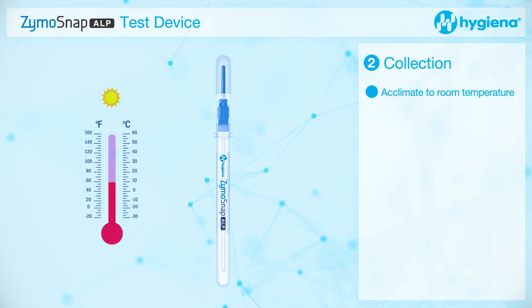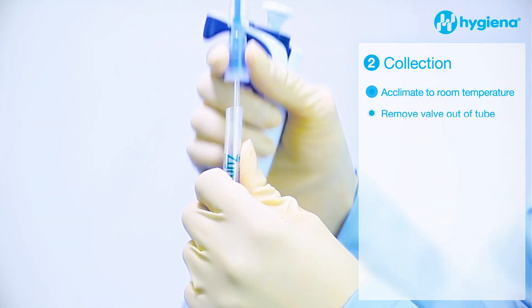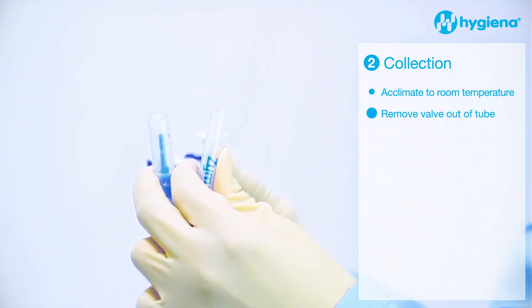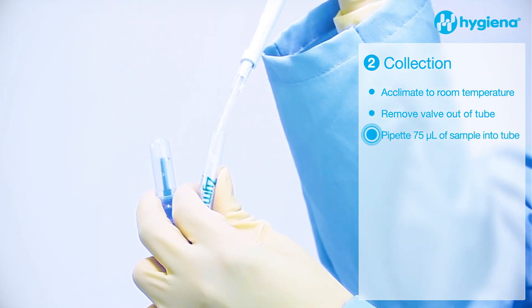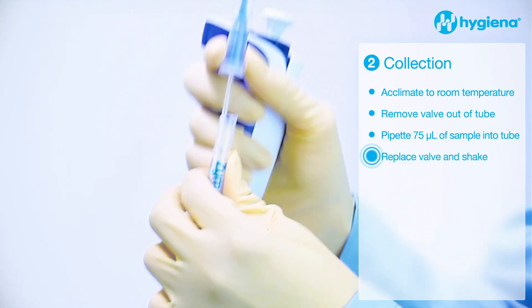Allow the device to acclimate to room temperature. Remove the snap valve out of the tube and pipette 75 microliters of sample into the tube. Replace the valve back into the device.